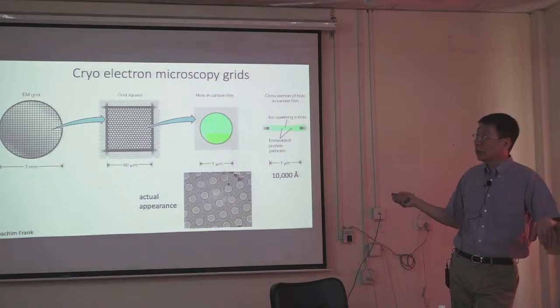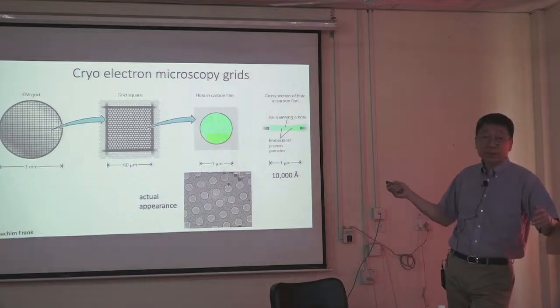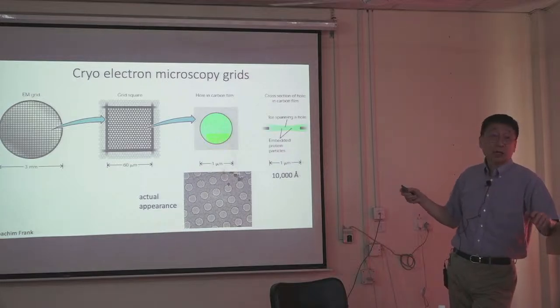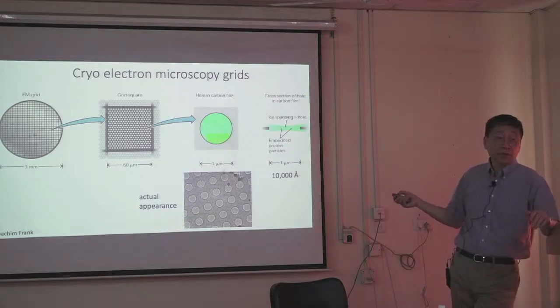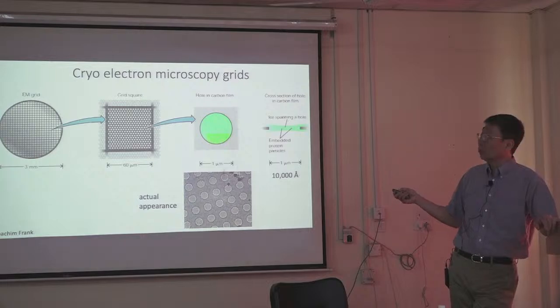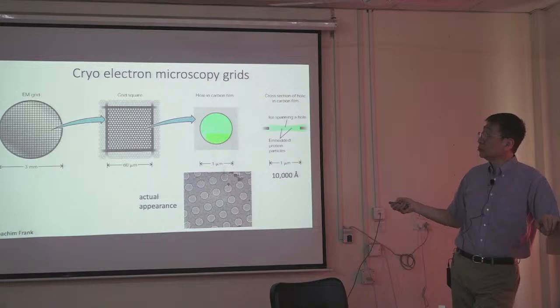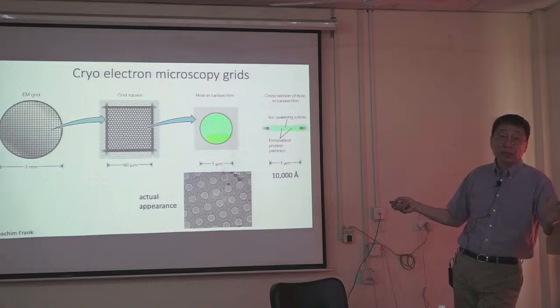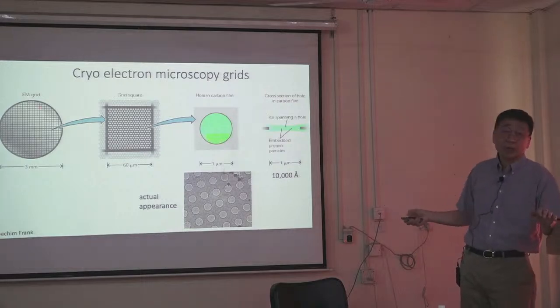I'll show you later today, hands-on, how to solve a structure using cryo-EM, going through the process. But this is the beginning stage. Before this, of course, is protein expression and purification. That we've covered already. Once you have that, you come here.